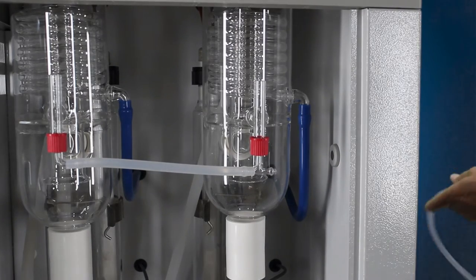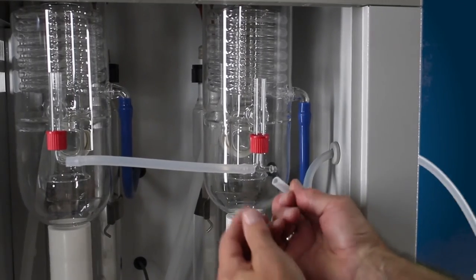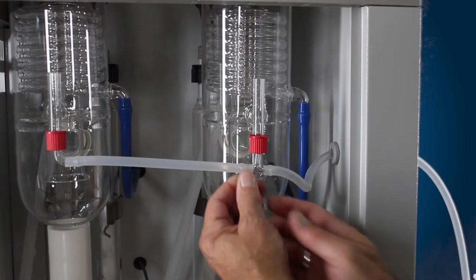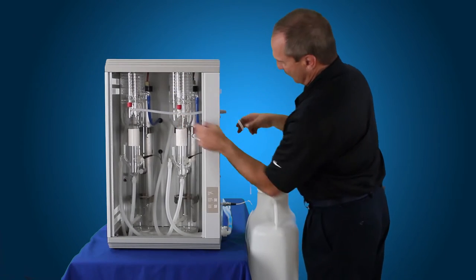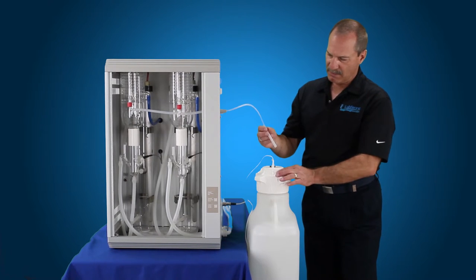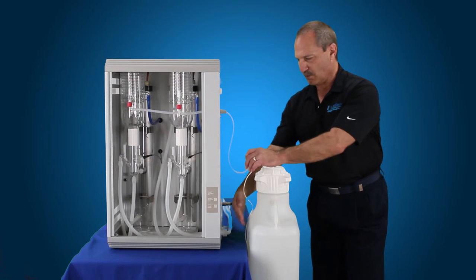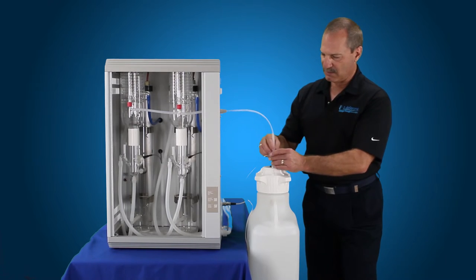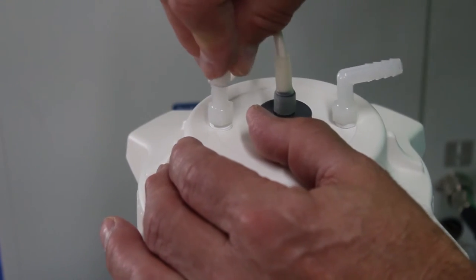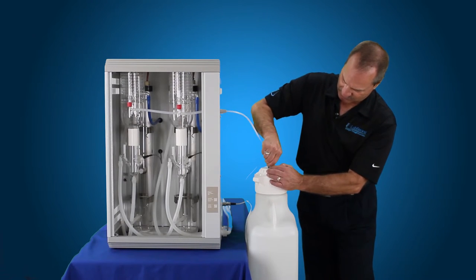Next we're going to connect our distillate tube. The tubing connects up to the port in the front — the straight port that goes straight up. Connect the distillate tubing into that. As you notice, when we have this tubing coming out it's not sagging, going all the way down and back up — there are no loops or drops in it. It has to come straight down, gravity feed from the condenser level down to the tank, because water will not flow uphill. Push that down until it's all the way down and nice and tight.